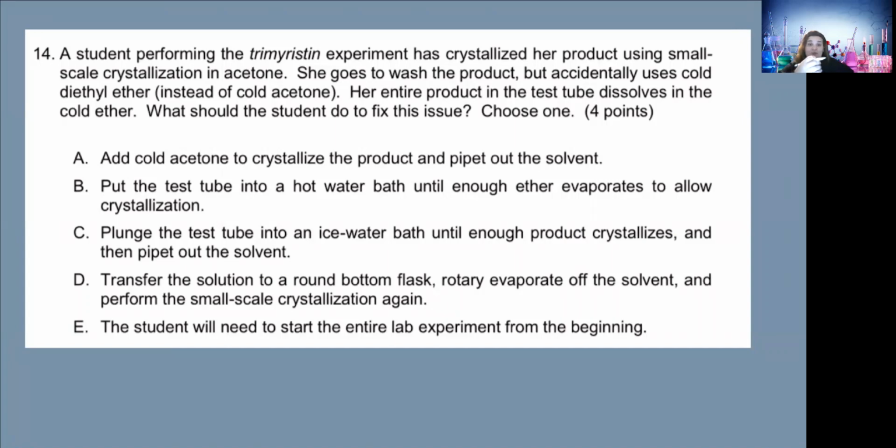So what happens when you mix crude trimyristin with diethyl ether? It dissolves. They tell us it dissolves, but I just want you to think back. In the beginning of the lab, our very first step was to mix diethyl ether with the nutmeg. How do you get rid of the diethyl ether? Will this student need to start over? The answer to that is no. There is a way to remove the diethyl ether. Do you remember the technique or the equipment we used to remove the diethyl ether?